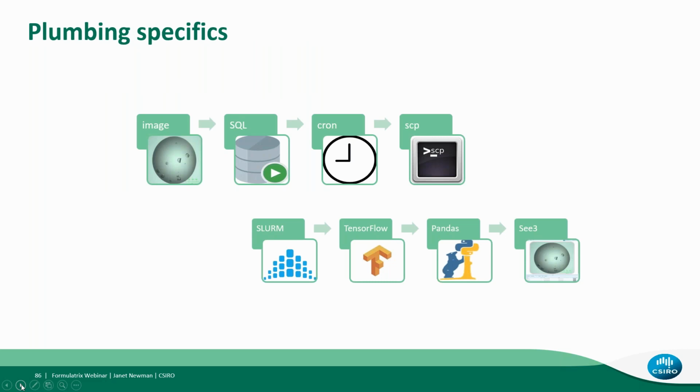So how do we do this in our lab? We have an automated system set up where periodically every hour we scan our database for newly collected images. This is then put through a cron job and a bunch of different queues, using Slurm and TensorFlow onto our GPU cluster. And then a score is estimated and then passed back into the database in real time, essentially. So it means that we get all our scores back within an hour of everything being imaged.